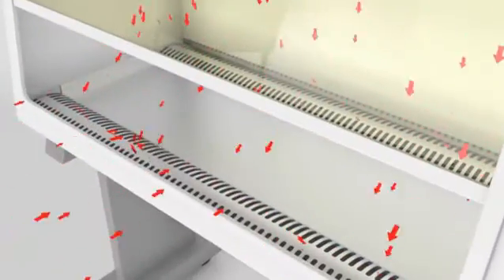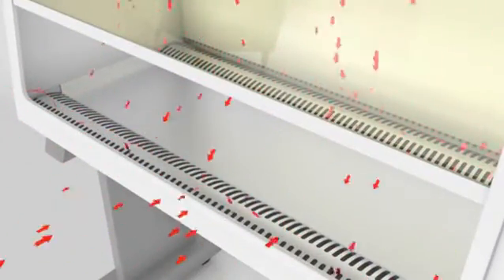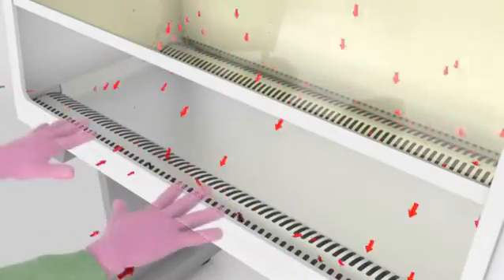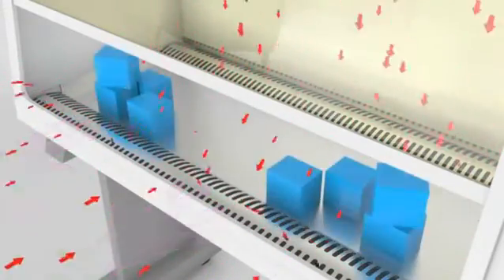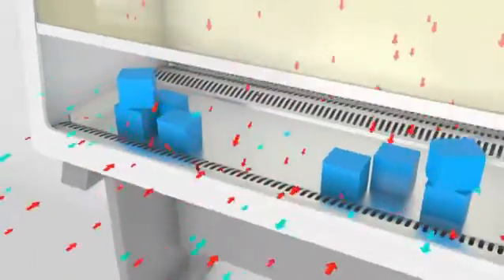But the efficiency of the cabinet air flow can be compromised by other factors such as overcrowding in the lab, rapid movement around the cabinet, open doors and windows and overcrowding in the cabinet.